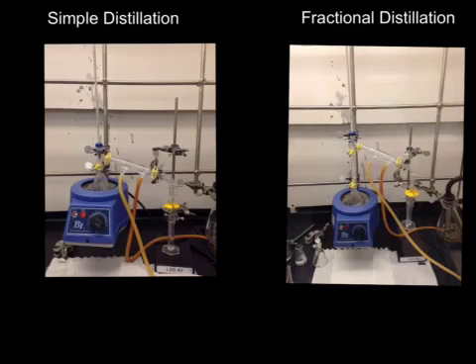The purpose of this experiment is to separate ethanol from a mixture containing both ethanol and water through the use of a simple distillation and a fractional distillation by comparison. When the two liquids are mixed together, the liquid that is more volatile will typically have a higher vapor pressure. Once the vapor condenses, it turns back into a liquid and it is collected every 0.5 milliliters until a total of 15 milliliters for the comparison of simple and fractional distillation.